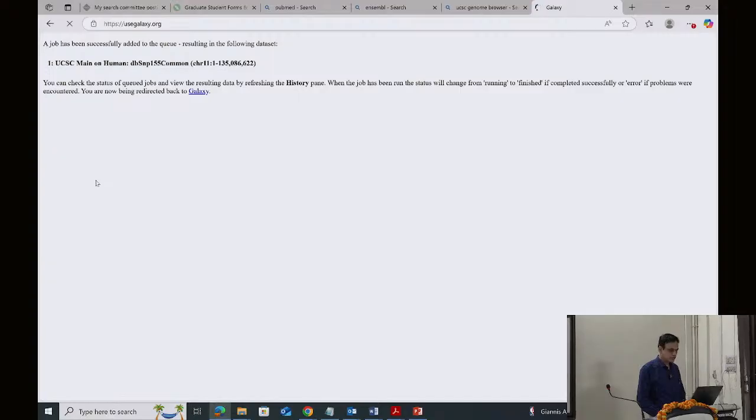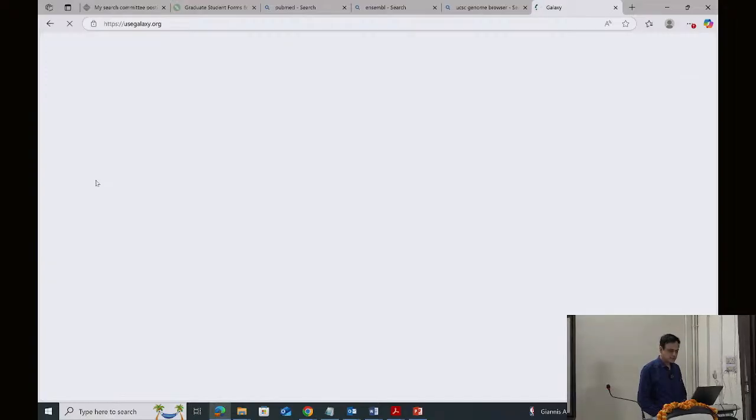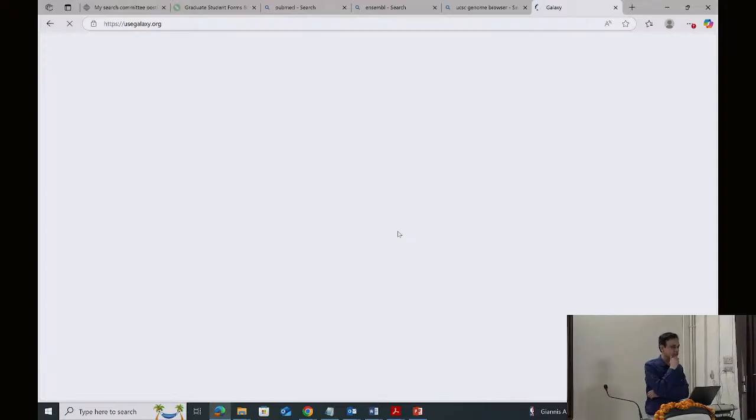Okay, so it is going to the Galaxy server at Penn State University in Pennsylvania. Yeah, just have patience.